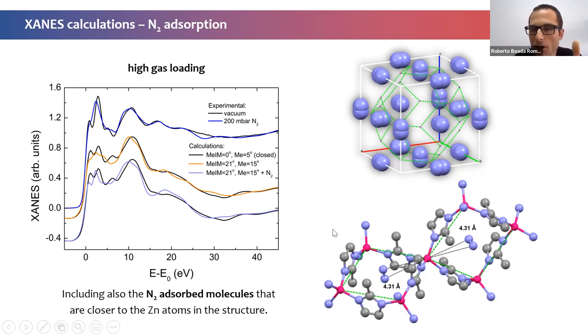Okay, there are many other nitrogen atoms, and it seems that this happens at high loading, so the openness of this string of this organic ligand allows the nitrogen to get into this location, even though we refer to the gate opening of this six member hexagonal pore. Okay, so it means the nitrogen is not like gas, but it is something like solid. So the nitrogen is solid, so it's just located there, but not solid. It's absorbing onto the framework. So we can speak in terms of condensation, okay? Because you get layers of nitrogen atoms that get absorbed in one layer, and then they get more. It's kind of condensation.